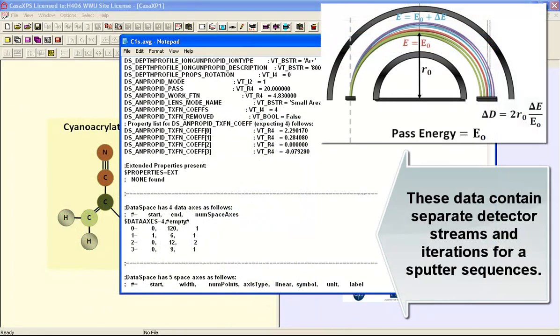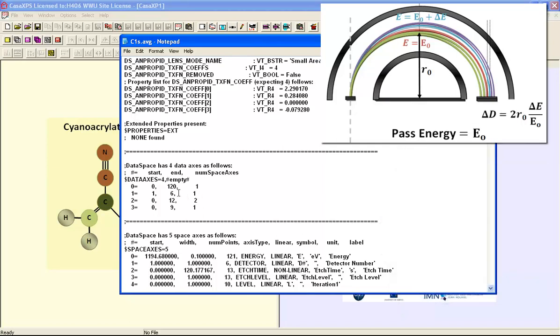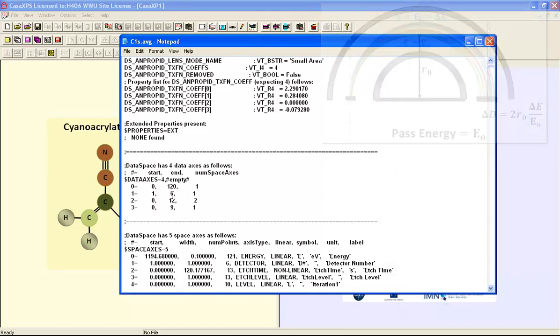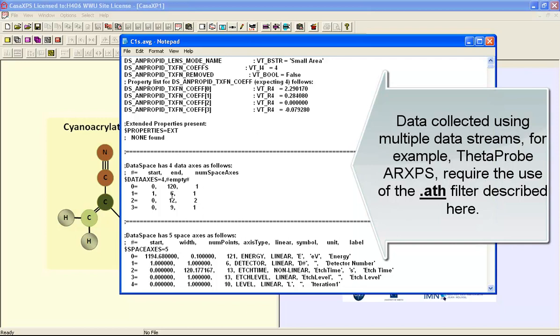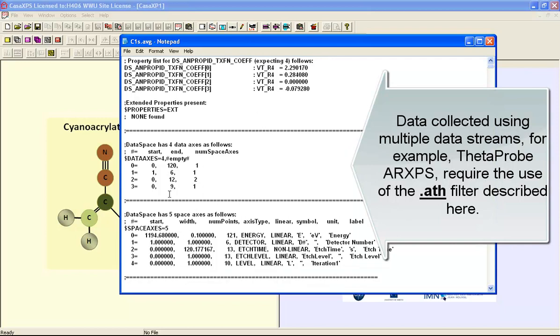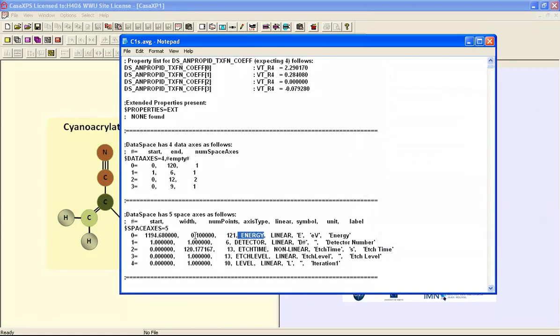All three have a similar format because they are all part of an etch sequence that involves repetition and splitting information into the streams from the different detectors on this instrument. So the data file contains an energy interval that represents in this case the Carbon 1S.